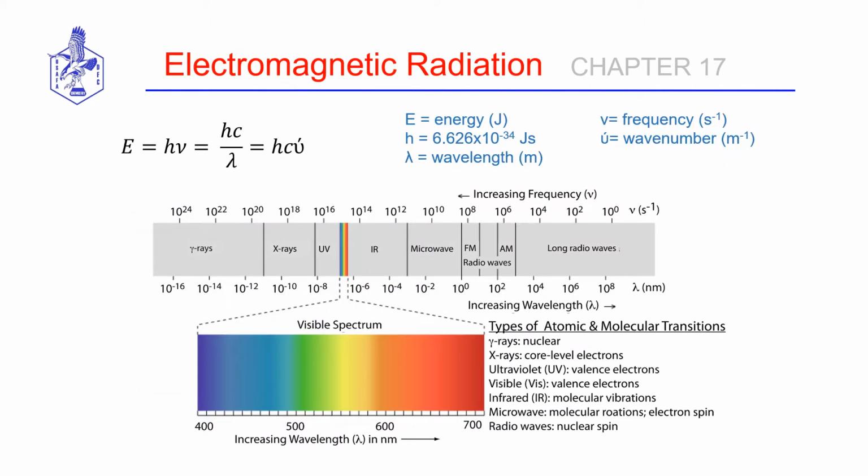So electromagnetic radiation, it's a form of energy, light energy. So we know that via Planck's law, that energy, E in this equation, equals Planck's constant, known value, times the frequency of light, that's nu. Okay, we know that lambda nu has got to equal the speed of light. So we can substitute in that equation and derive energy equals Planck's constant times the speed of light over lambda.